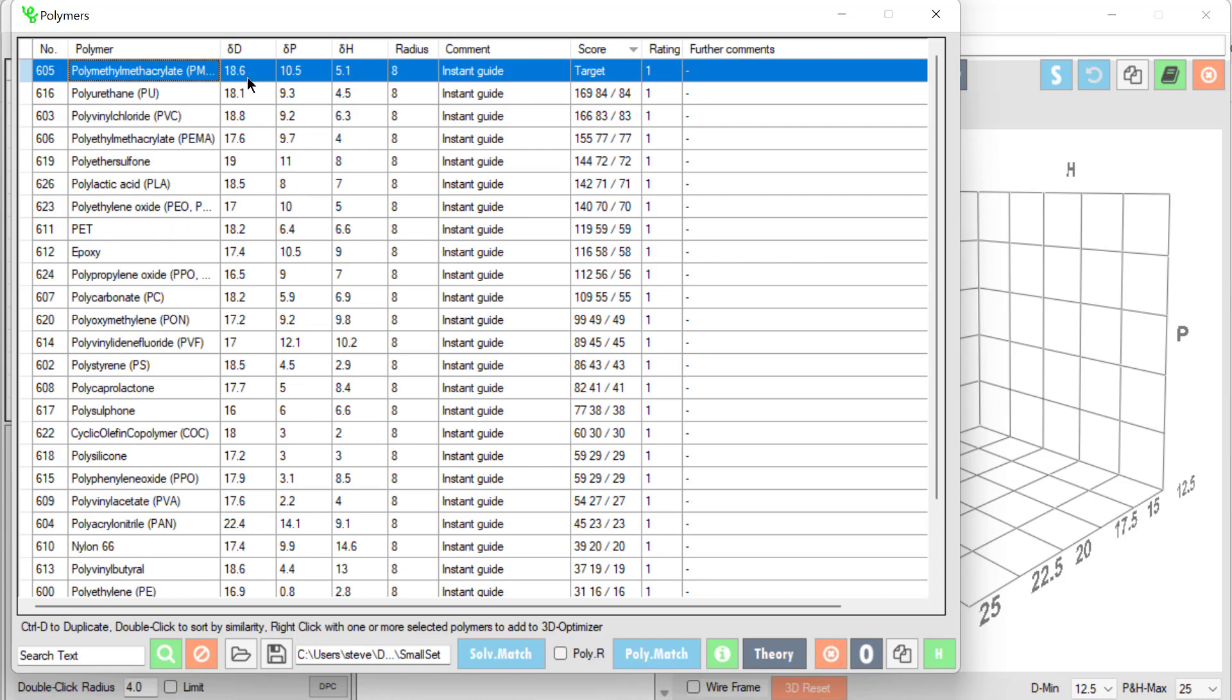The distance is the sum of the squares of the differences between the DD, DP and DH values. So we see that this polyurethane is quite close to this PMMA whereas PEMA is a bit further away.